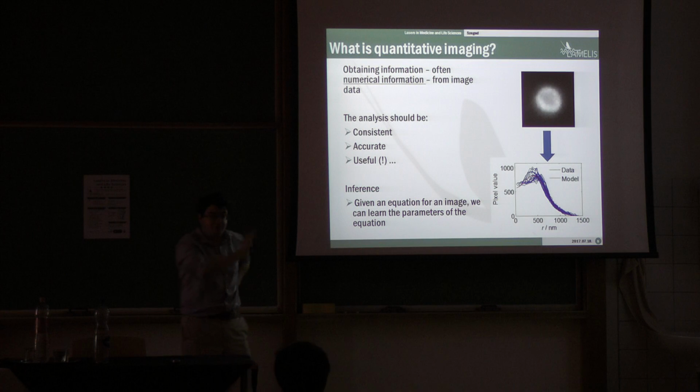So that's the point of what I want to do. I want to do mathematical inference. I want basically an excuse to do some equations and then to fit the equations to some image data and do this on a large scale in the computer. Okay, so that's the principle. In principle, I'd like to do very accurate, useful measurements in super resolution microscopy.